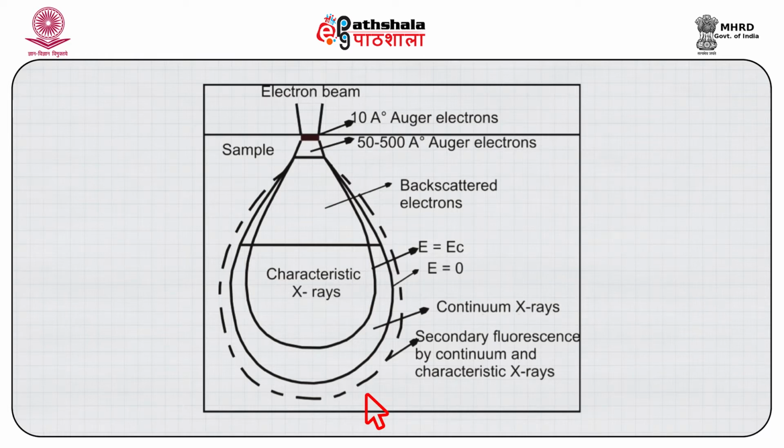One, the characteristic X-rays, which means that they refer to a particular energy level transition within a particular atom, and the other, a continuum of X-rays, which represents the background material, and we need to know both if we were to characterize the chemical heterogeneity in a material. The characteristic X-rays produce a very good effect to chemically quantify the nature of the material.